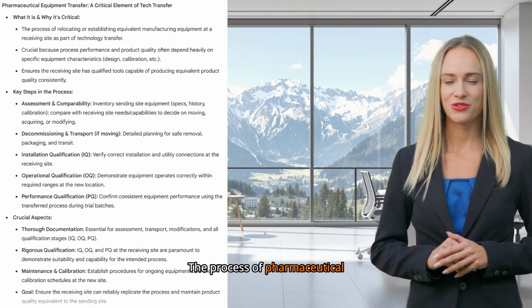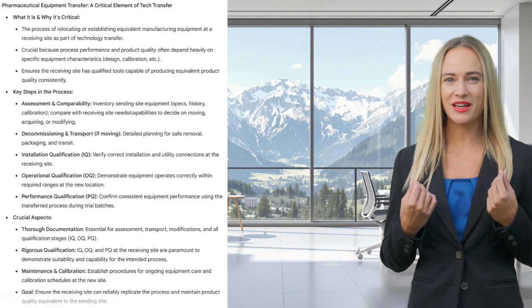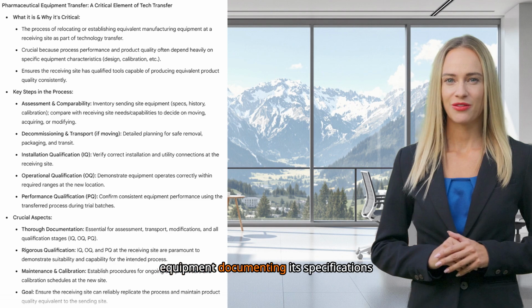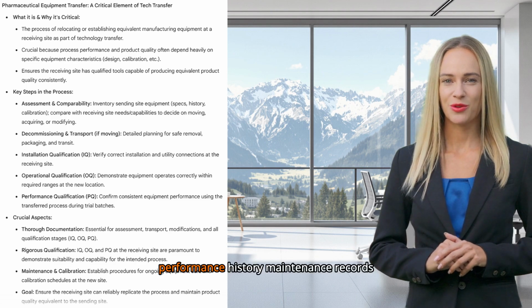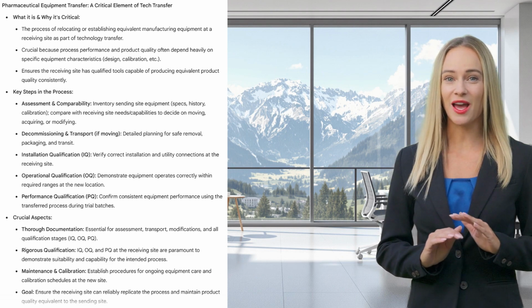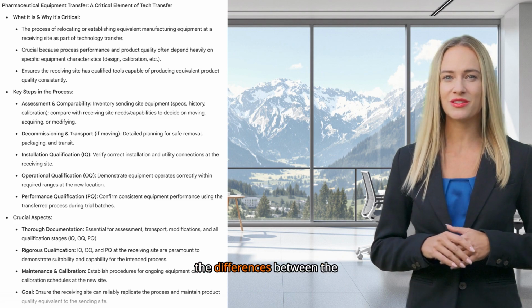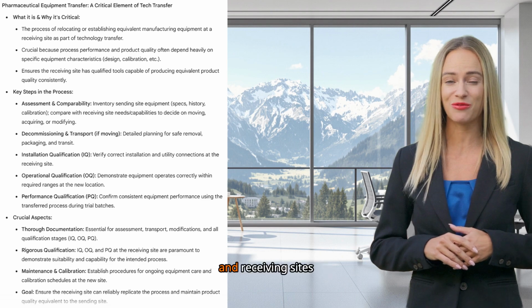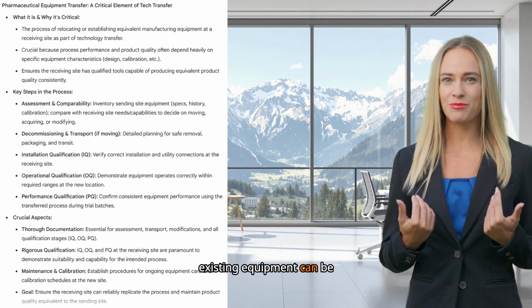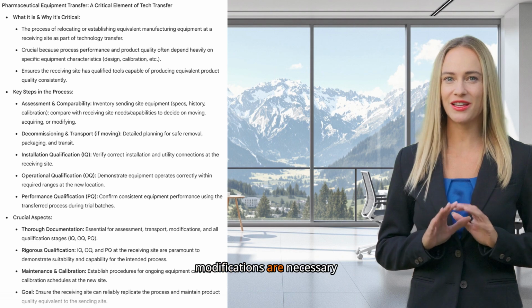The process of pharmaceutical equipment transfer typically begins with a detailed inventory and assessment of the equipment at the sending site. This includes identifying critical equipment, documenting its specifications, performance history, maintenance records, and calibration status. A comparability assessment is then conducted to evaluate the differences between the equipment at the sending and receiving sites. This helps determine whether existing equipment can be moved, new equipment needs to be acquired, or modifications are necessary.